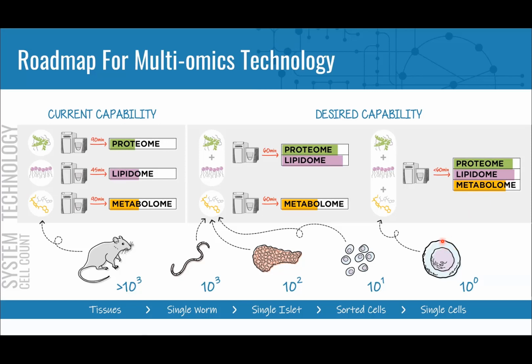And that will be really useful for being able to go from looking at tissues and samples where you have tons of cells to looking at single cells. Imagine you put the single cell at the head of the column, you crack it open, all of the contents go on, and we have one method and we see everything. You can't look at the proteins on a separate instrument if you've got the single cell, right? It's all going to have to be done together.